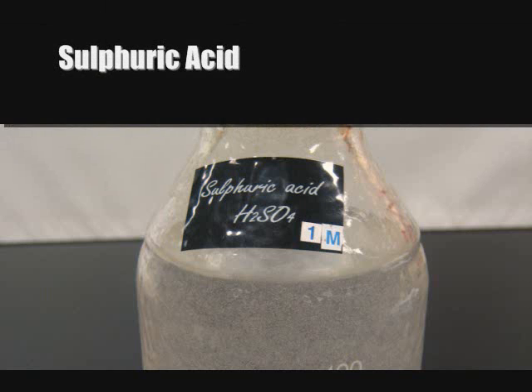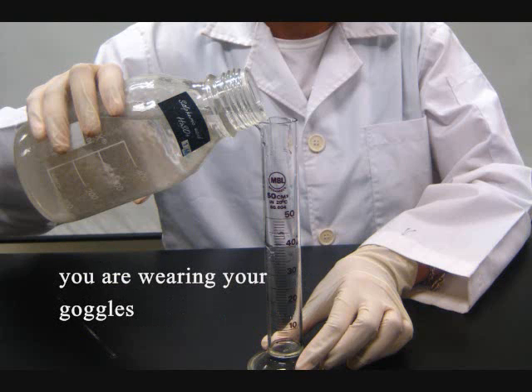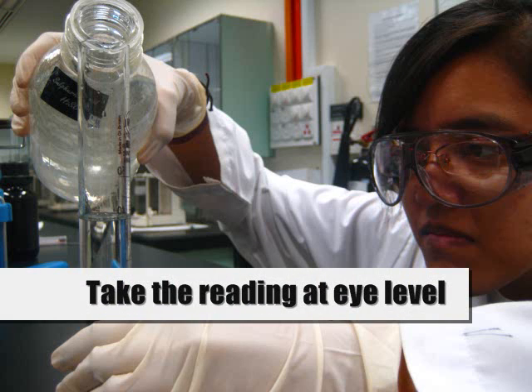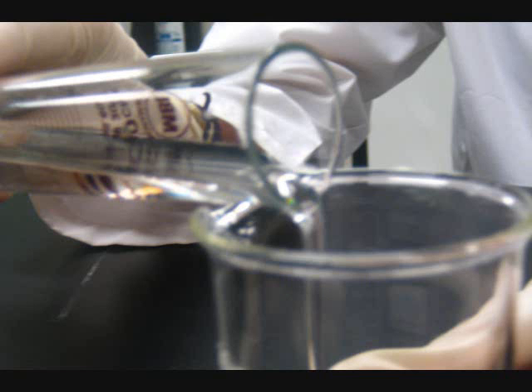Measuring the volume of sulfuric acid: carefully pour sulfuric acid into a measuring cylinder. Ensure that the measuring cylinder is on the tabletop and that you are wearing your goggles. Minimize parallax error by taking the reading at eye level — this will improve the accuracy in the percentage yield of copper(II) sulfate. Record the volume by reading the measurement below the meniscus, then transfer the sulfuric acid into the beaker for heating.